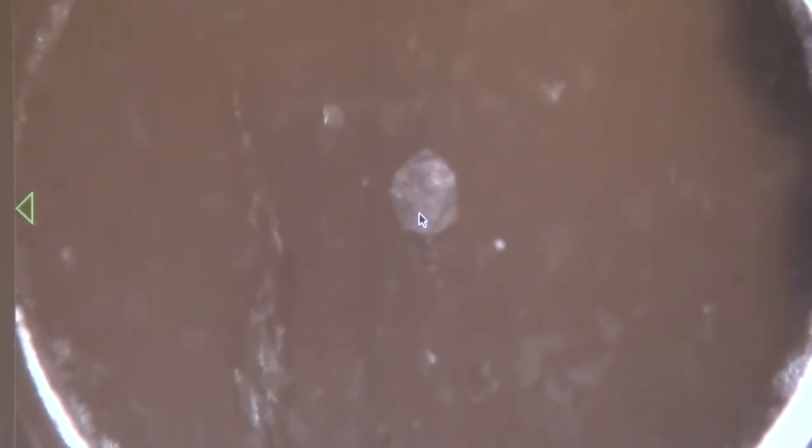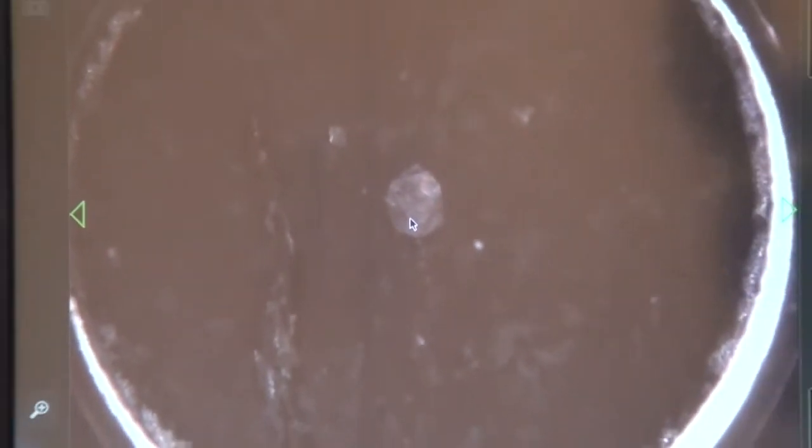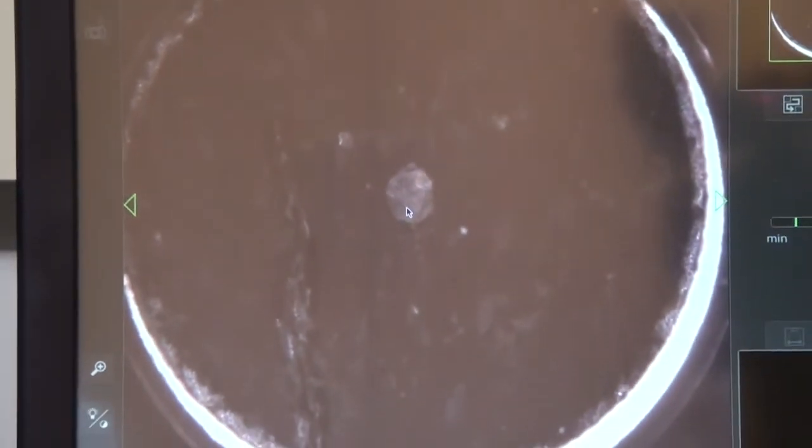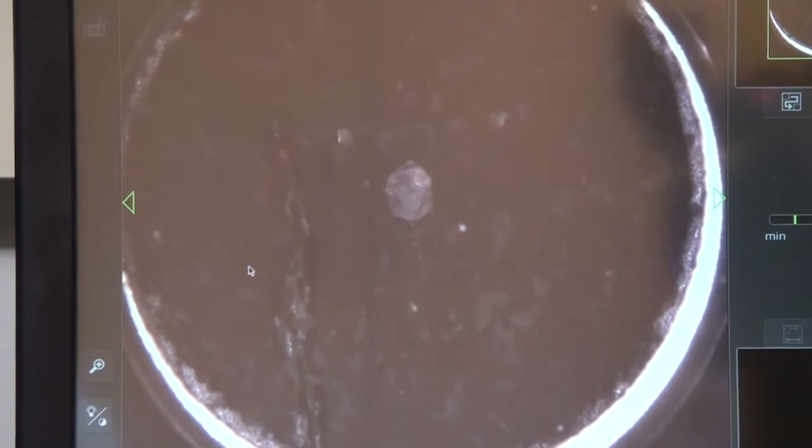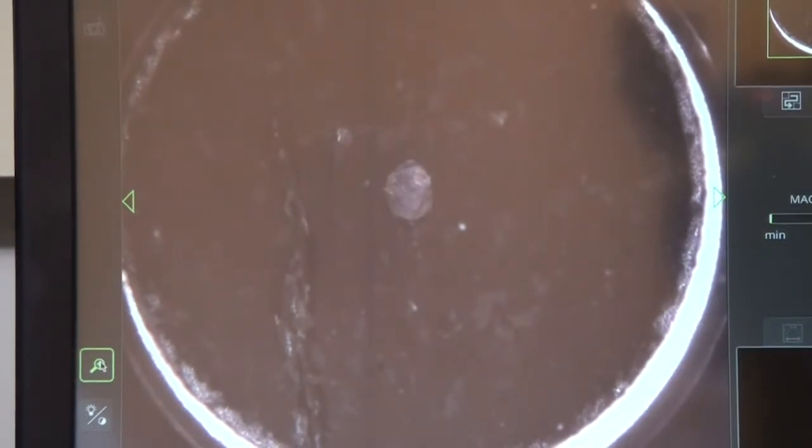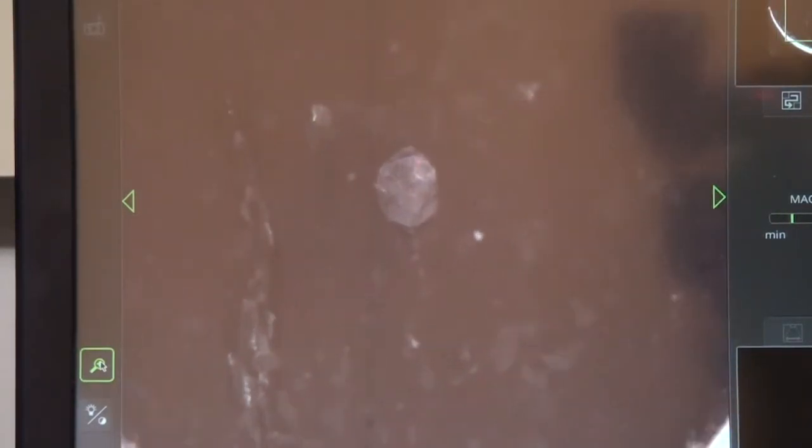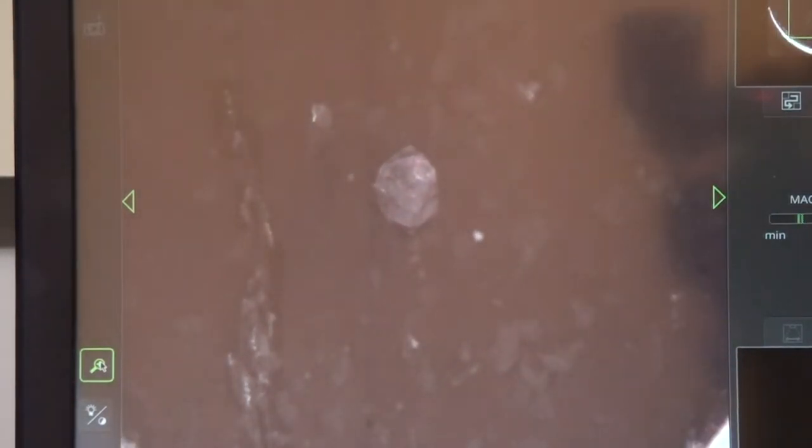Let's zoom in to take a closer look at our calcium fluoride sample. It's a tiny chunk of fluoride.